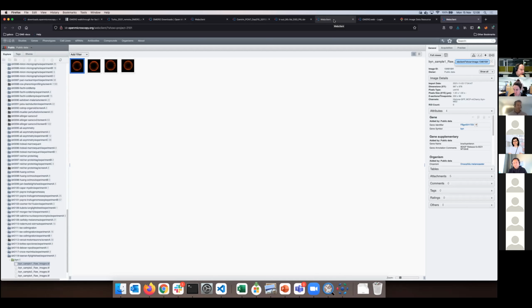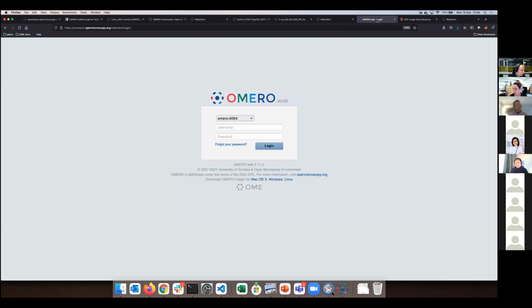So I think that we need to find a happy medium between having credentials and fully public. So I think we're working in the middle, because the previous version was not really. We slowly realized it was not going to scale, because initially we just put the image. Now they want the annotation, then they want the analytical result. They want all the general knowledge associated to an image. So we were replicating in another context what the private, the log secure environment was doing. But that will come with the new effort we're working on. Yeah, thank you very much for that answer.